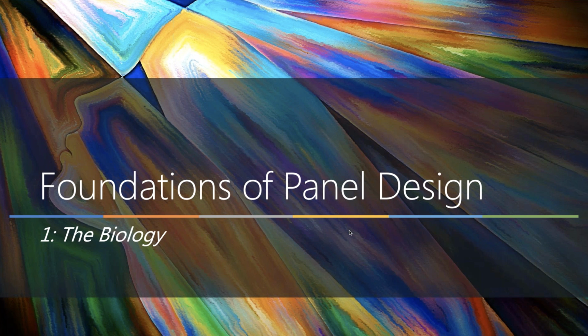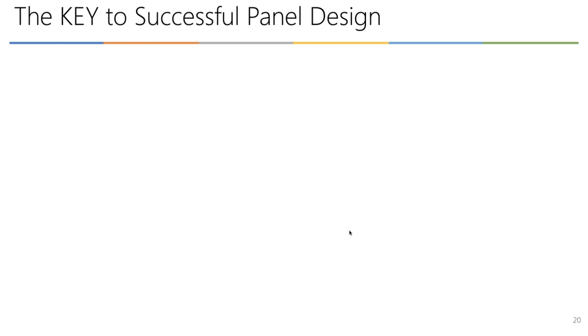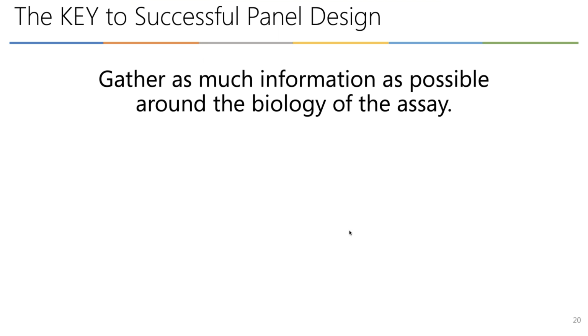We receive a lot of requests about panel design, and my answer to many of you and colleagues who come asking for help to design a panel is, this is a biological assay, and the foundation and the only way to get data is to know as much as possible about the biology. This is where everything starts. So we need your help to gather as much information as possible around the biology of the assay.